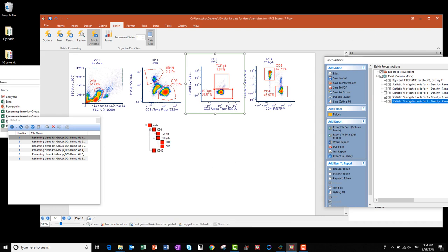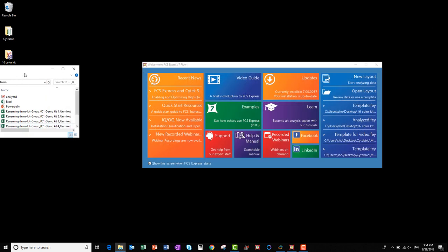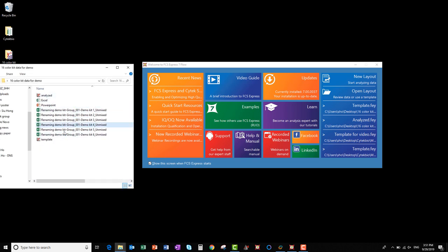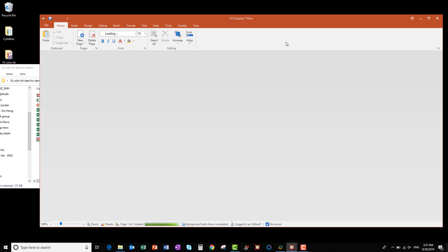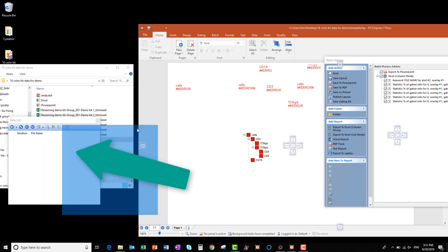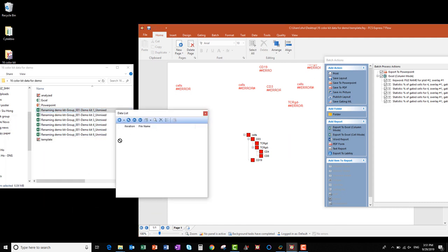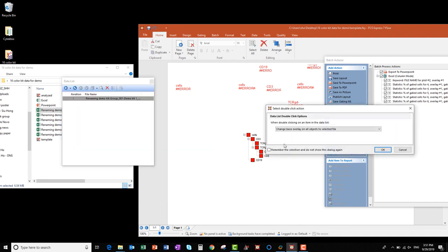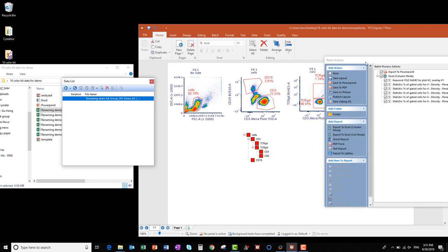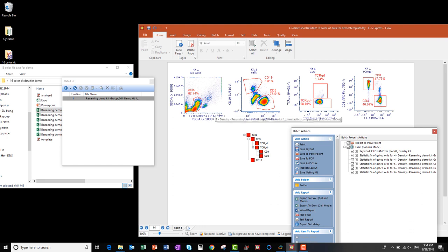Now I'm going to close my FCS Express file and go to my folder with all my data. I can open the layout file with unlinked data, which I call Template. Once it opens, let's take a look at the data list. You can see that my data list is empty and there are no files linked to it. To use this template and add files, I simply drag and drop data files into the data list. Then double-click on the data file and make sure in the window that appears that the option is set to Change Base Overlay on All Objects to Selected File, and click OK. Now I can see all the data in the file and I can adjust the gates as needed.